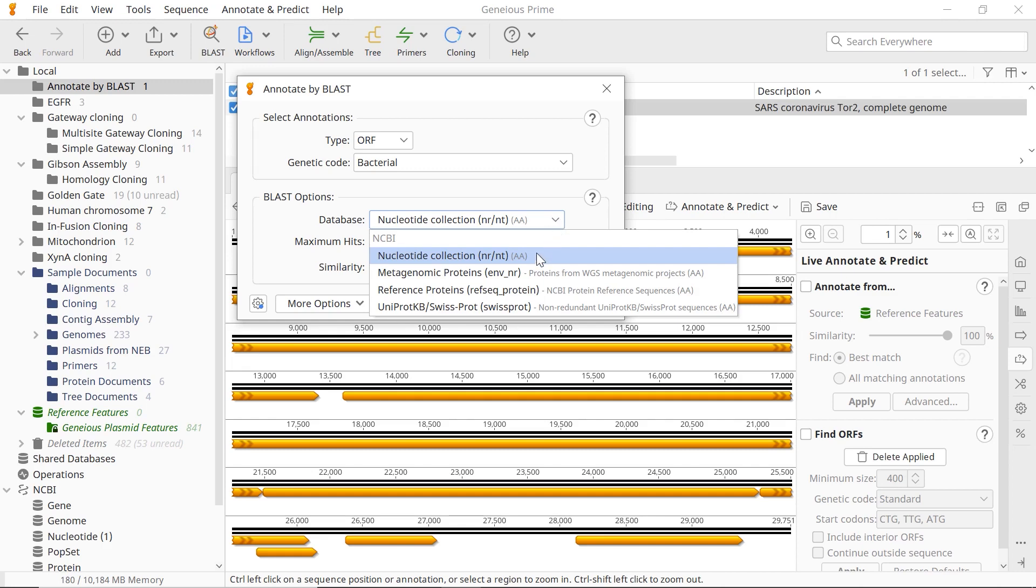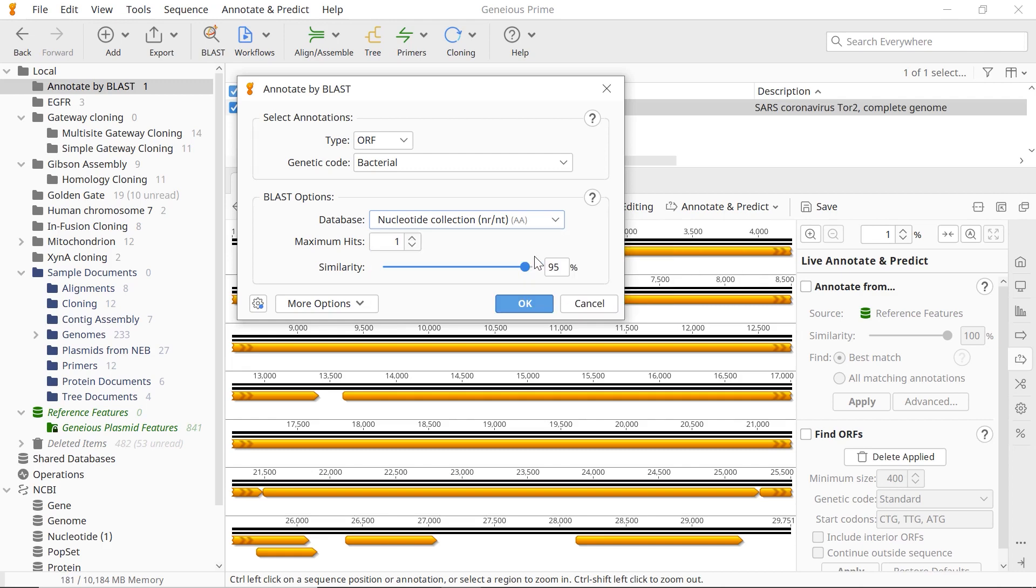You can also set the number of BLAST hits to return using the Maximum Hits option. The tool will only annotate the top hit if more than one hit is selected and the hit covers the same sequence region.